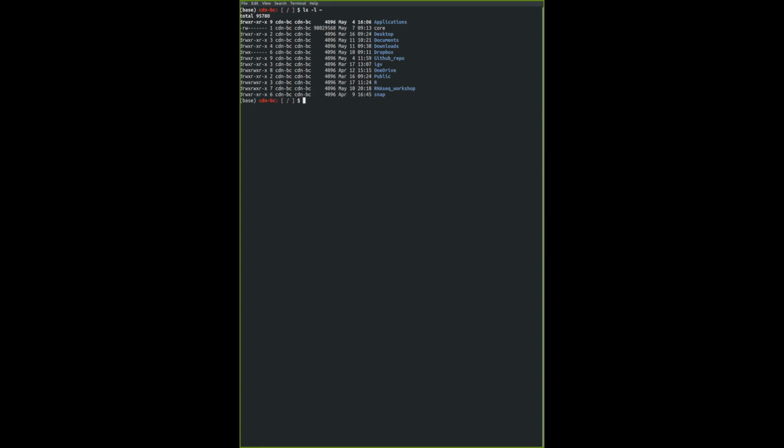On my computer, I see this list of folders and files in home. I'm pretty sure on Mac you should see a very similar file system. On Windows it might be a little bit different, but you get the idea of listing folders somewhere more distant as compared to your working directory.